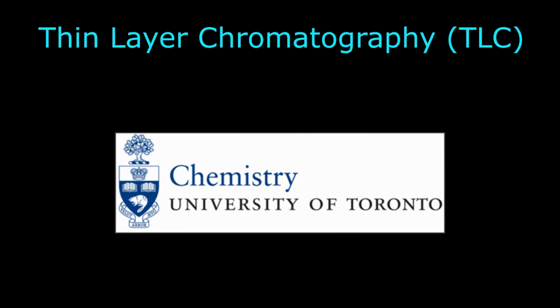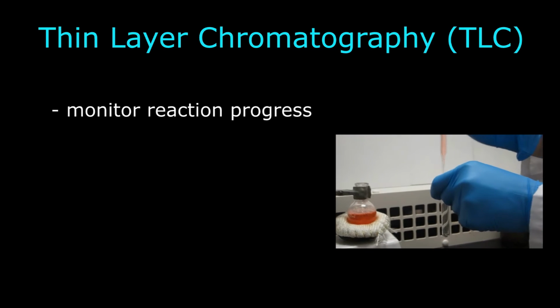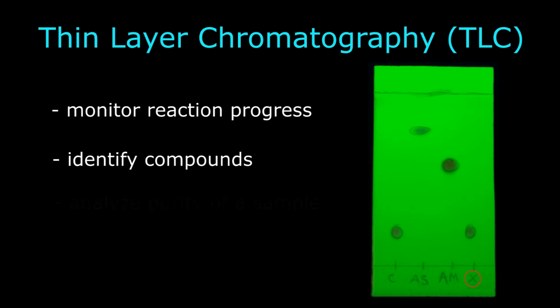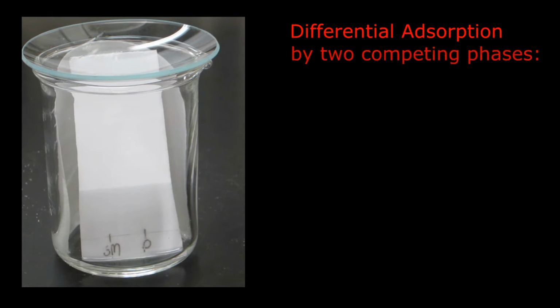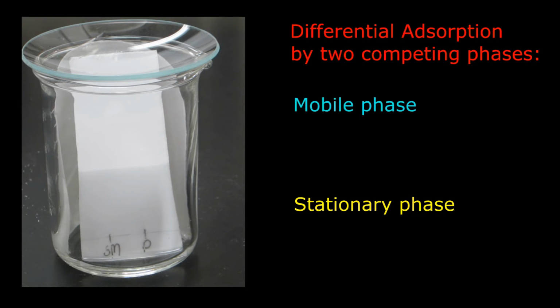Thin layer chromatography, or TLC for short, is a qualitative technique used to monitor the progress of a reaction, identify compounds, or analyze the purity of a sample. TLC is based upon the concept of differential adsorption, in which a compound is exposed to two competing phases. This involves a stationary phase called the adsorbent and a mobile phase, which is the solvent.